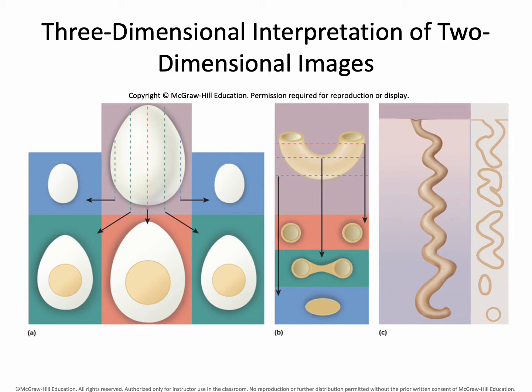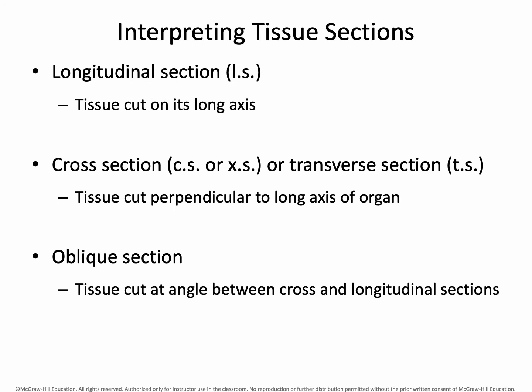If you think of sweat glands, when we look at our skin slides next week, the sweat glands might not really be continuous with each other. When they go in and out of the plane of the section, it may not look like one continuous piece. So just keep that in mind when you're viewing these.